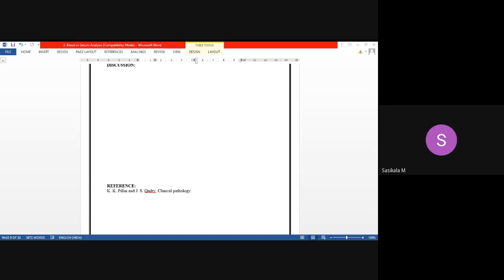Now let me share with you the old record readings so that you can copy them in your observation, write it and submit it for evaluation.